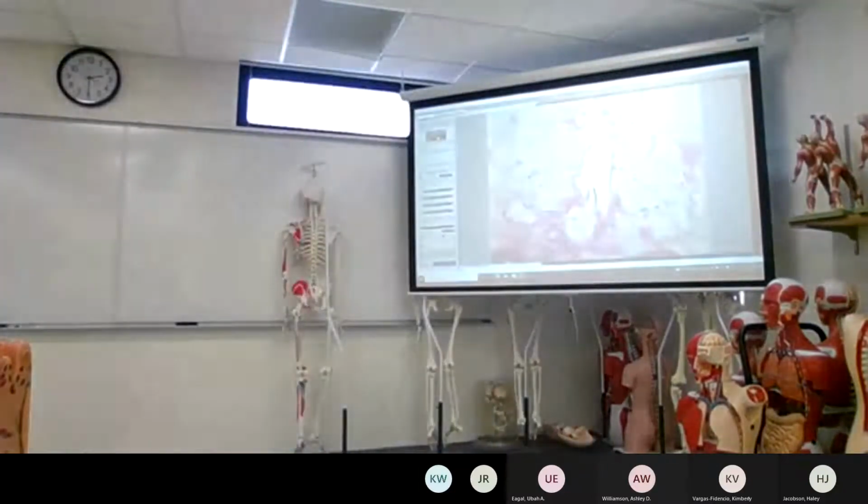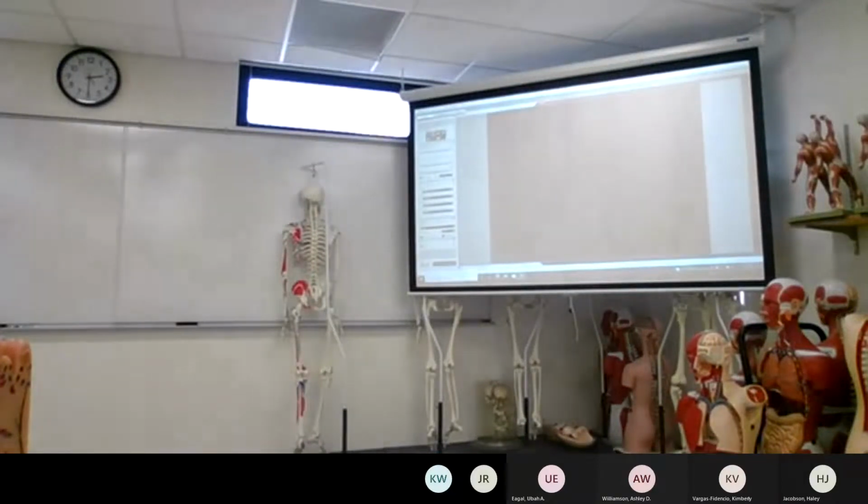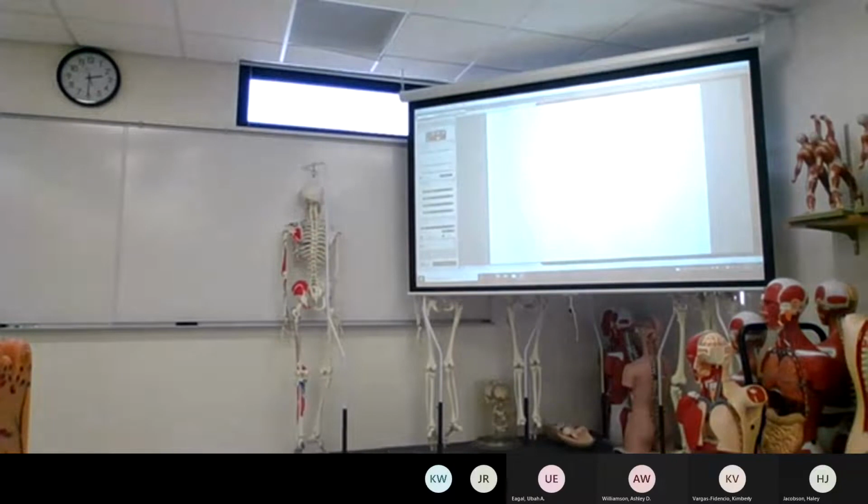So, next one. And again, I like when you see a lot of fat, it looks like this in the microscope. So look at those cells in the corner and to the edge, it's showing you the fat cells. Okay?